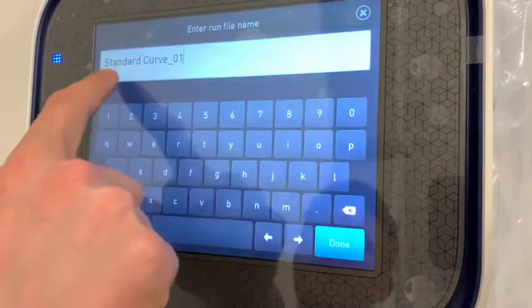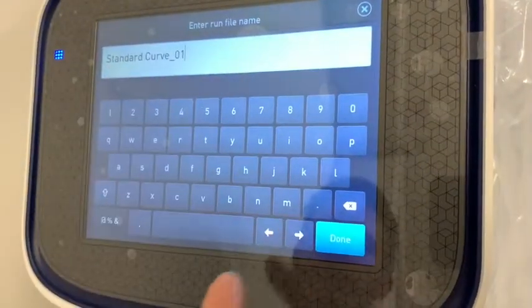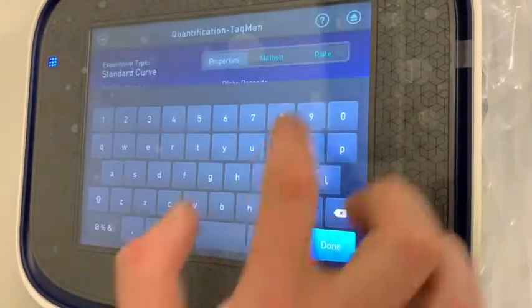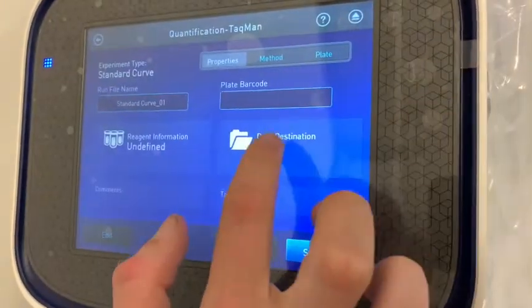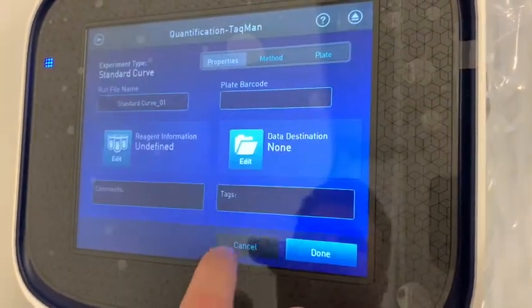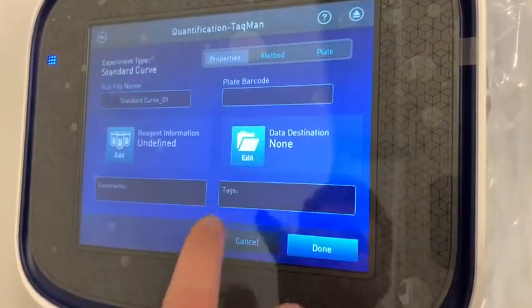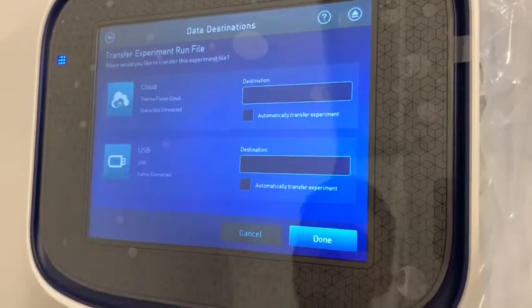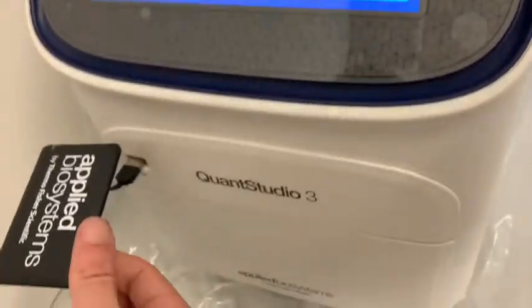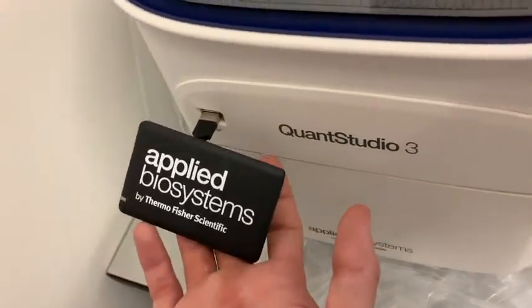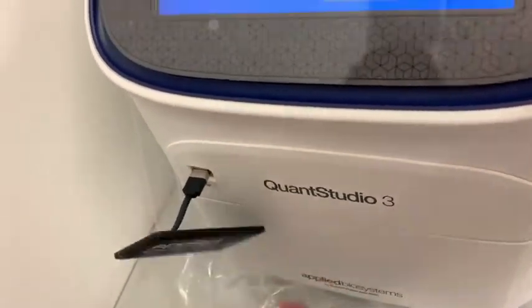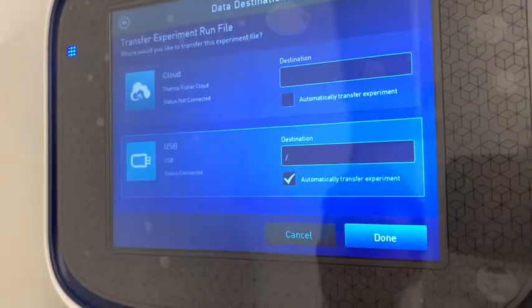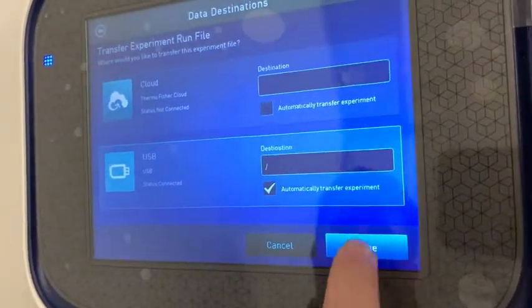Insert the name of your file run. Choose the data location, which will be the USB stick that is also supplied and has to be connected. Click on Done.